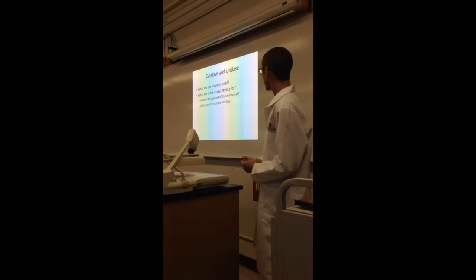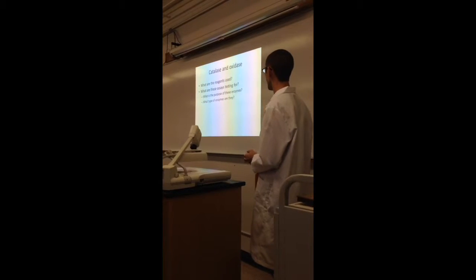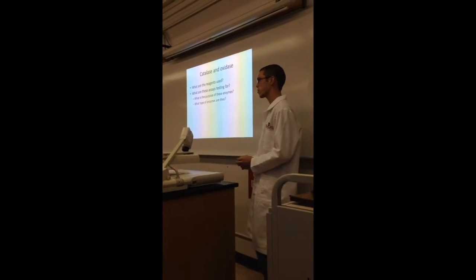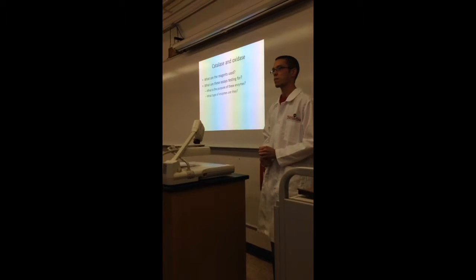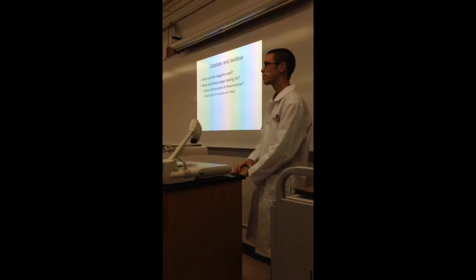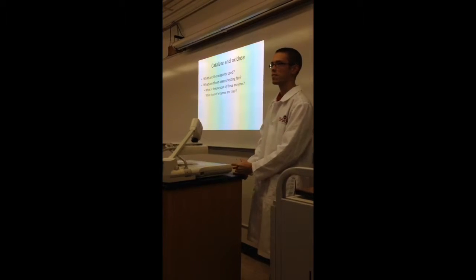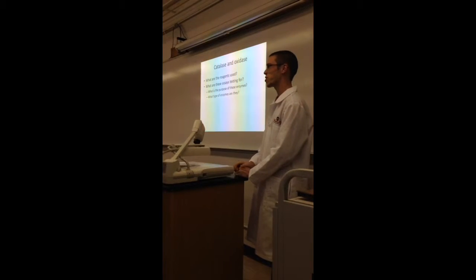So for catalase and oxidase, you'll be expected to know these on the test. You want to know what the reagents are that are used and what these assays are testing for. Does anyone remember the reagents for either catalase or oxidase? What about oxidase? It's kind of a trick question. It's as easy as it should be. So it's Kovacs oxidase reagent.